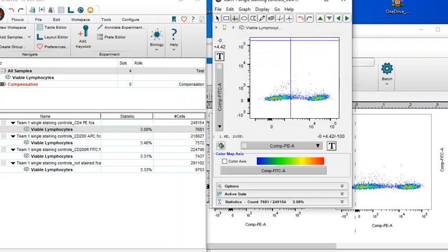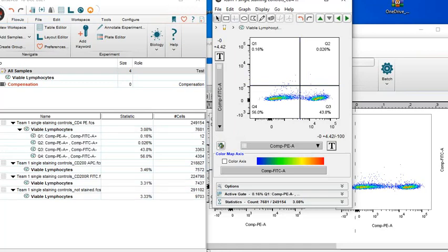So we are going to use this. We are going to measure where the line is, where it meets between the two of them, and we drop. Now you can see the quadrant with its percentage showing clearly.